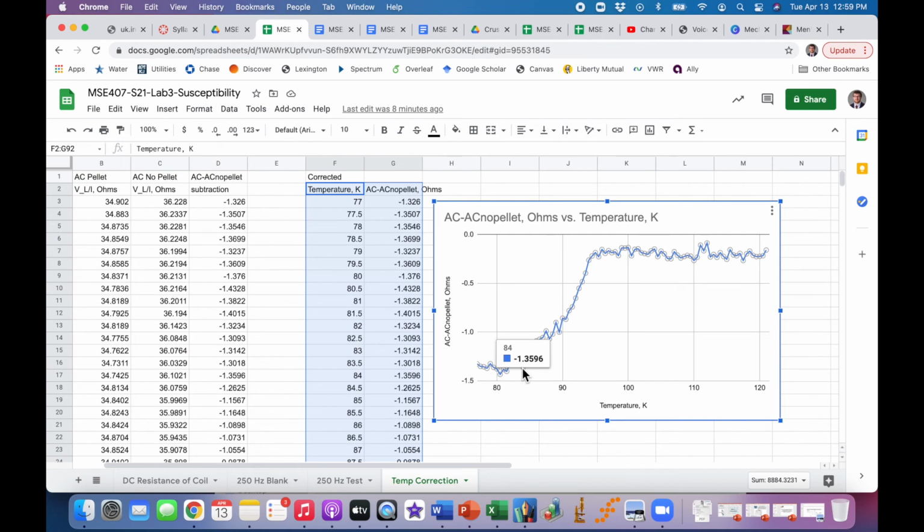It's a little hard to see, but about 84 all the way up to 94, right? So this tells us that the temperature width over which that transition occurs is 10 degrees, or 10 K. That's another important region. We typically want these transitions to be very sharp, and so knowing how wide that transition region is is important. So we've got the width of 10 degrees.